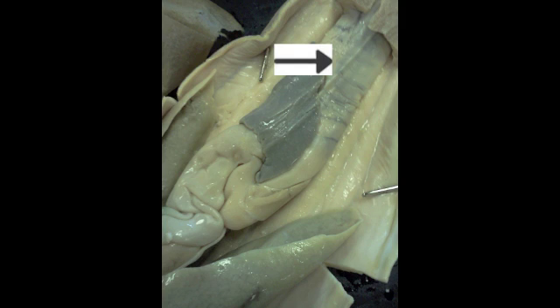This arrow is pointing to the valvular intestine. After the food has passed through the duodenum, the food goes into the valvular intestine. This second part of the intestine is where digestion and absorption happens. Inside the valvular intestine is the spiral valve, which is a screw-like shape that adds more surface area so that the food can be absorbed. The pig does not have this valvular intestine. Rather, it has a large intestine.